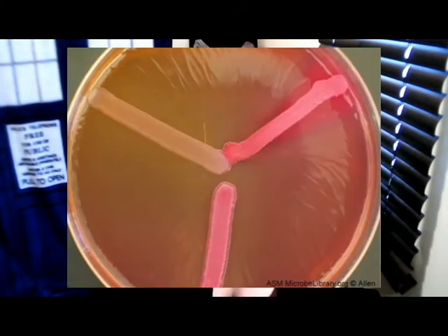MacConkey's agar, which I couldn't find, is the agar that contains lactose, salt, and a pH indicator. So this is also a selective media. It selects for gram-negative bacteria, but it's also differential.